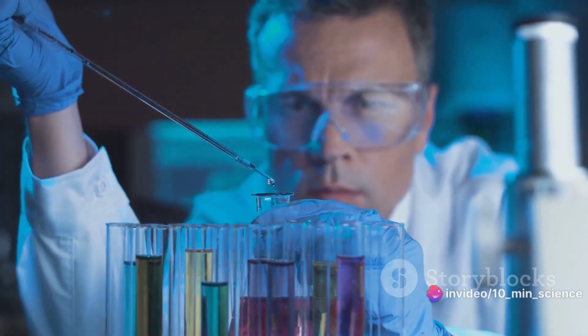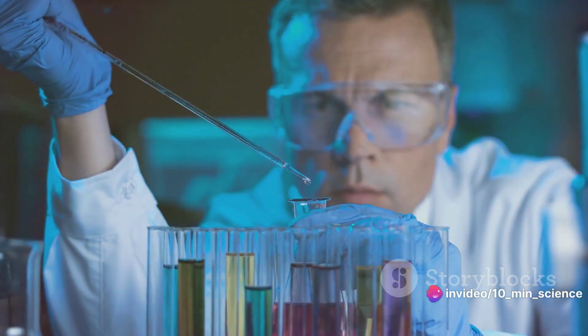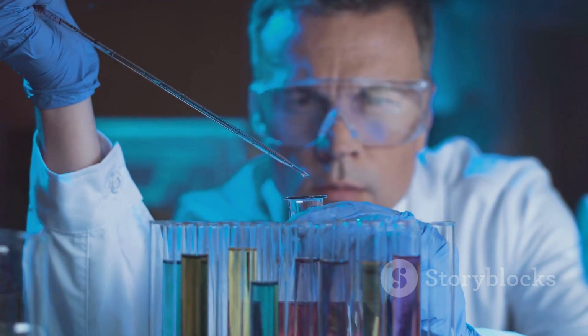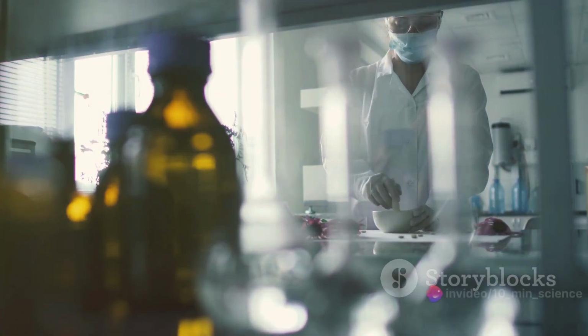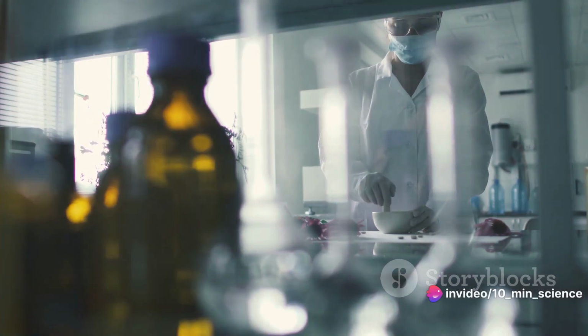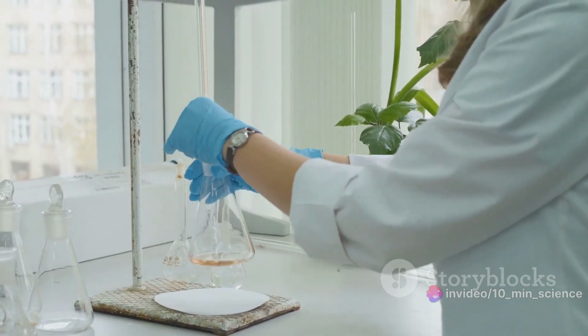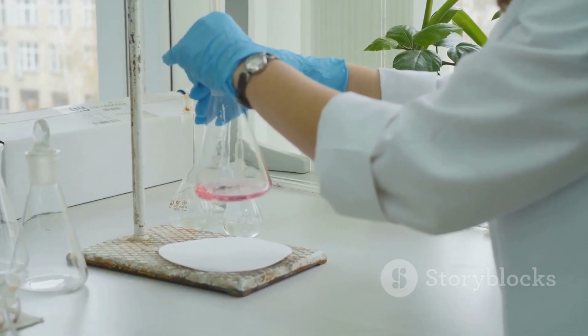First, you add your sample to the HPLC system. Now, this is where the internal standard comes into play. You add a known amount of this internal standard to your sample. The key here is that this internal standard has a similar behavior to the analyte, the substance you're trying to measure, but it's distinctly different, so it can be easily differentiated in the analysis. As your sample goes through the HPLC process, it may experience a variety of changes. Changes in volume, degradation of the sample, or variations in injection volume can all affect your final results.